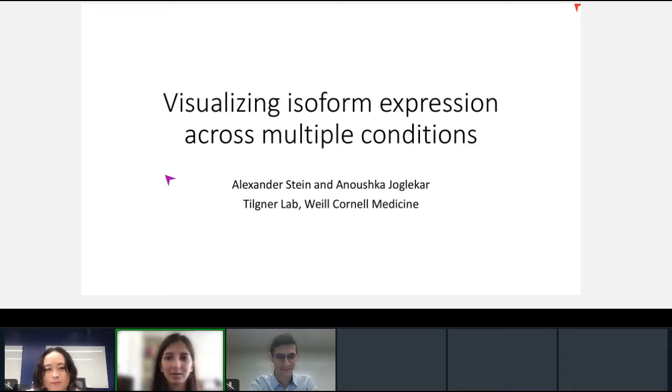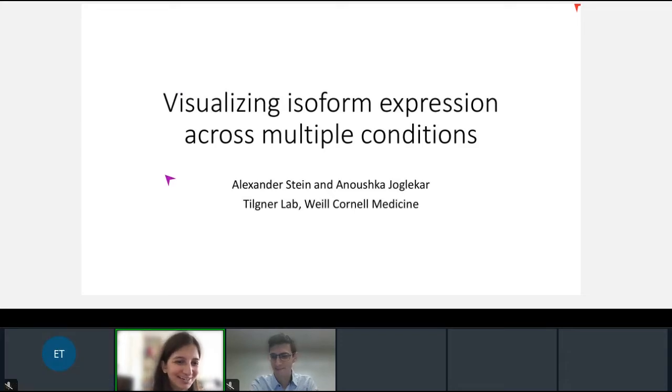Okay, excellent. Thanks, guys, for having me over. Today, I'm going to be talking about visualization tools that we and other people have built. And this is work that was led by Alex in the lab. He was a research tech. He's here to answer all of the technical questions today. And with that, well, I think Roger went over most of the single-cell Iso-Seq, so I don't need to go into the details.